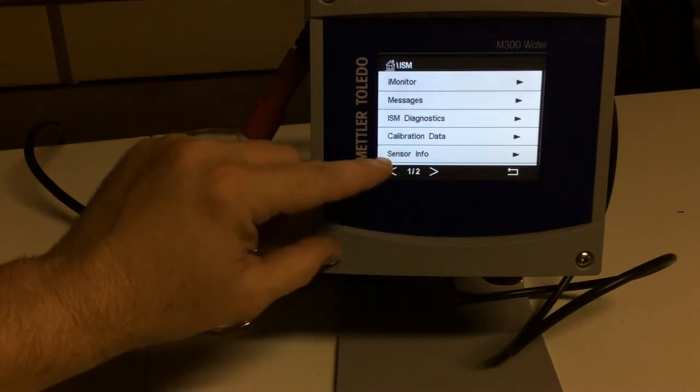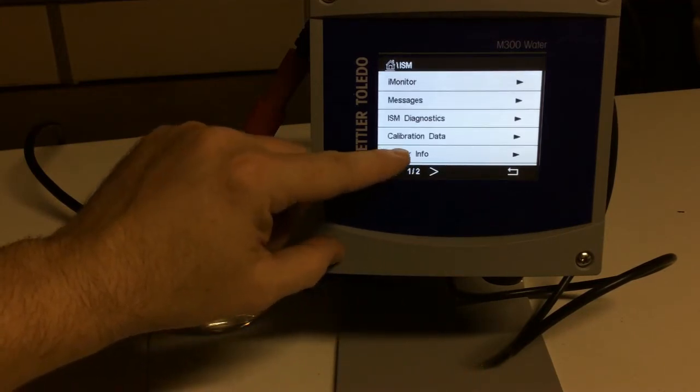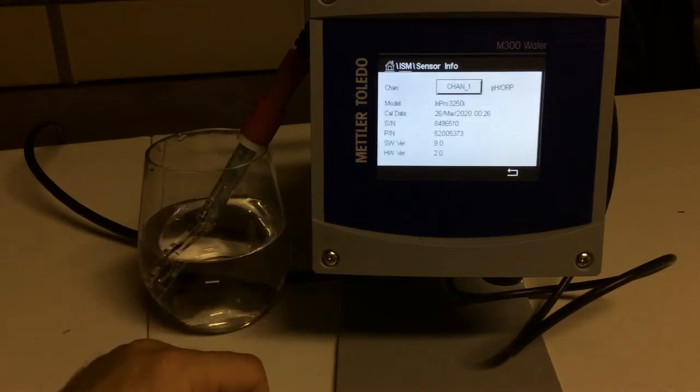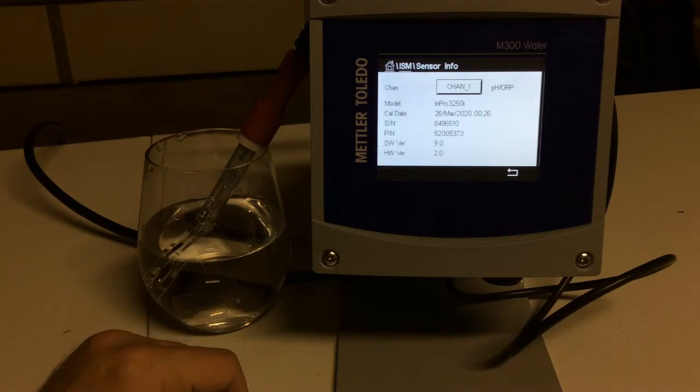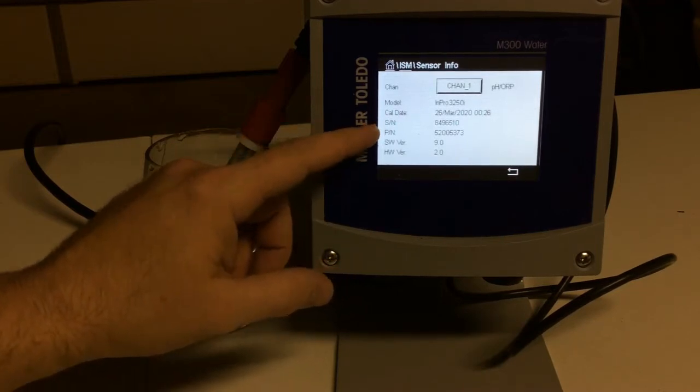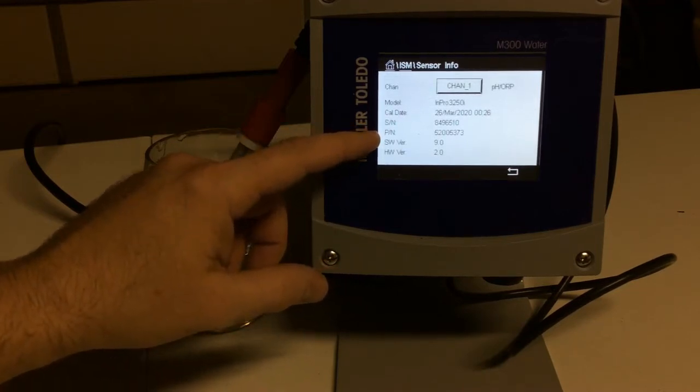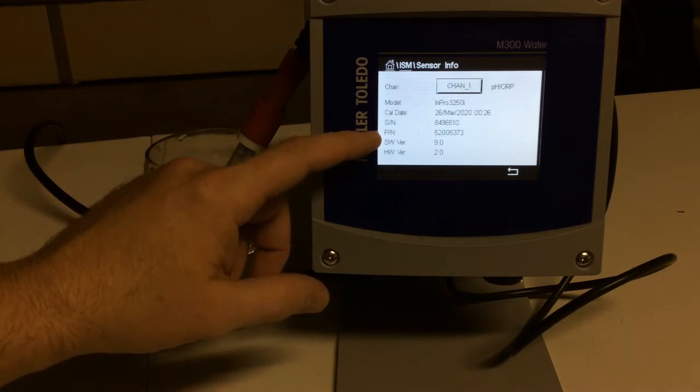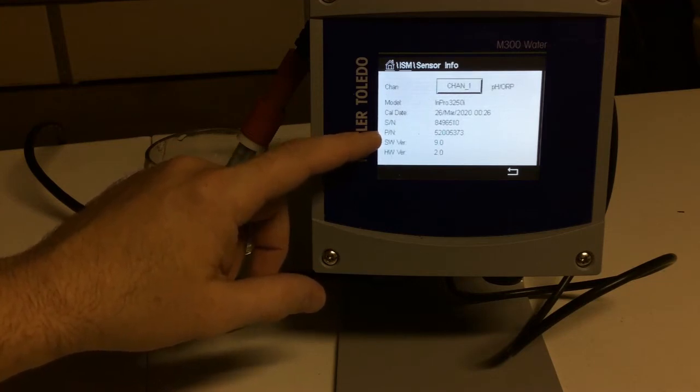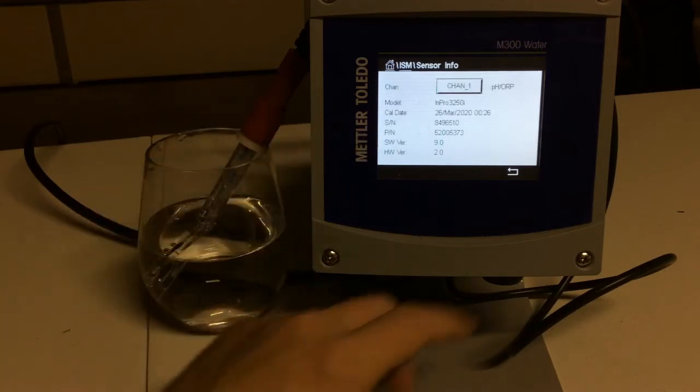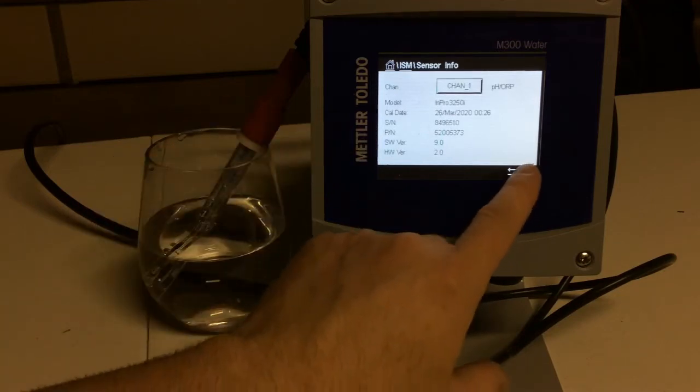Another cool feature I like, it offers sensor info. So if this sensor is in the process and you don't know what part number you had, if you don't want to take the time to go find the order to see what that part number is, we can hit sensor info, and we see our serial number, and then we see our part number. So you can call me up and say, hey Joel, I need to order 52005373, and I'll get those coming your way.